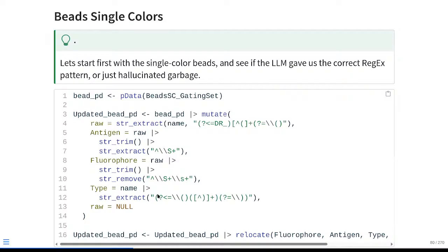So as you can see, this is why I will give this task to an LLM. I don't want to have to remember what this hieroglyphic code is to get at a particular pattern for a file name that will often vary from one data set to the next.